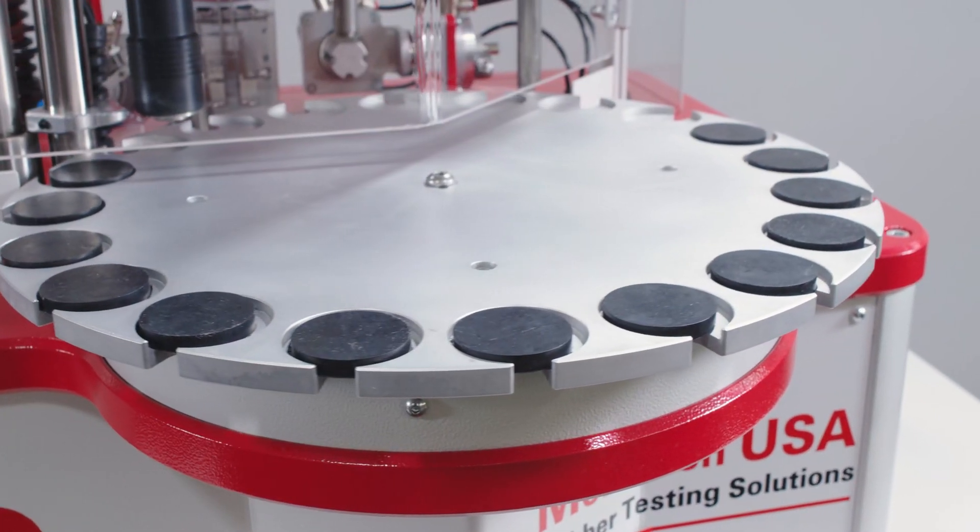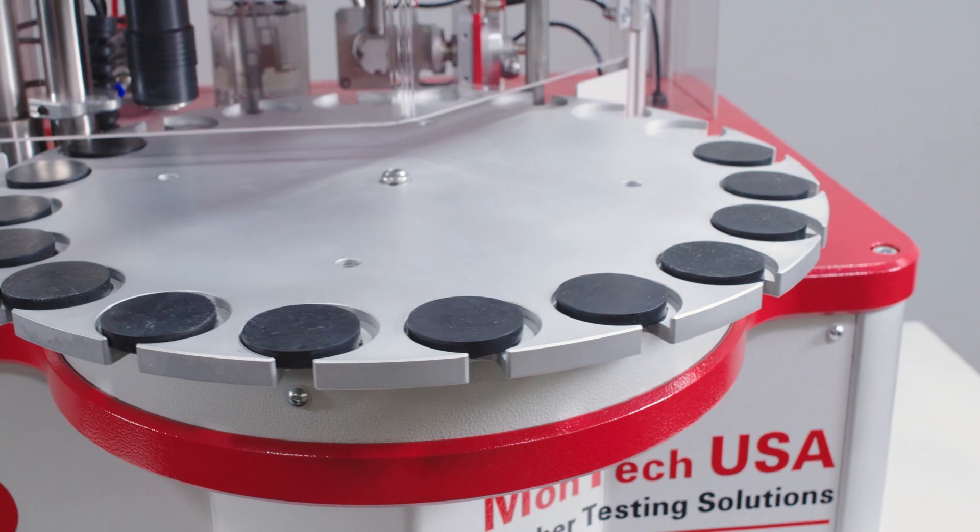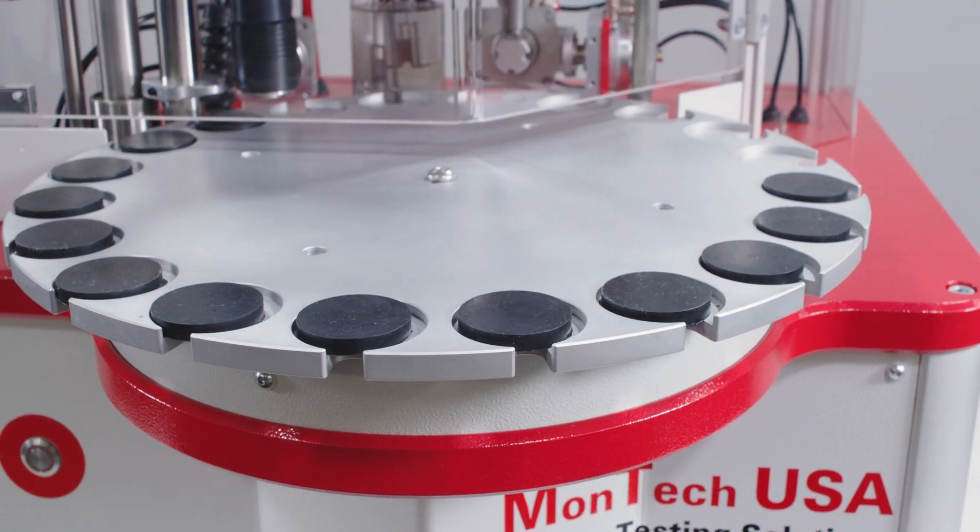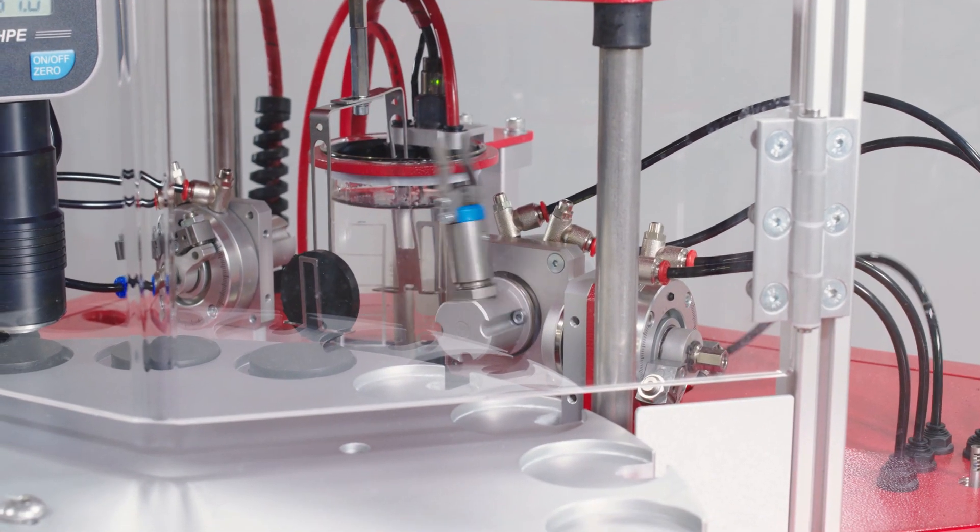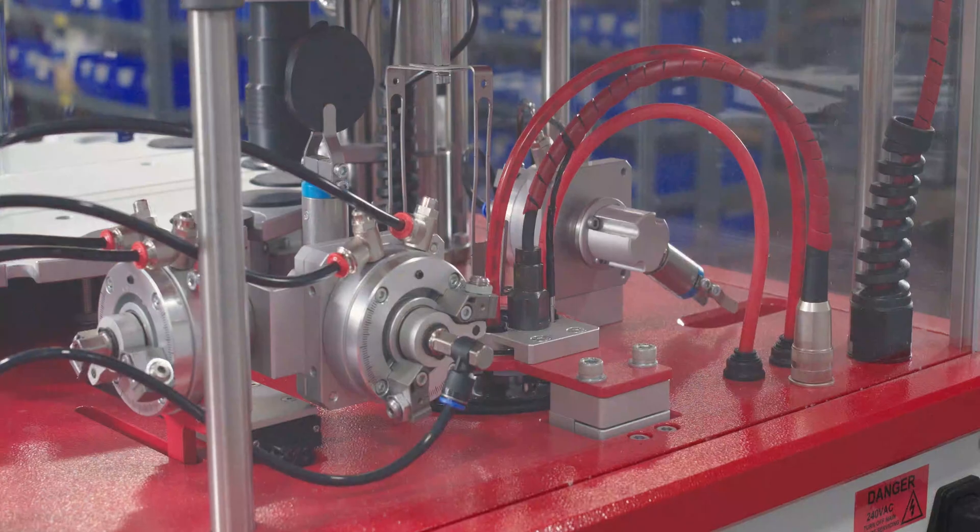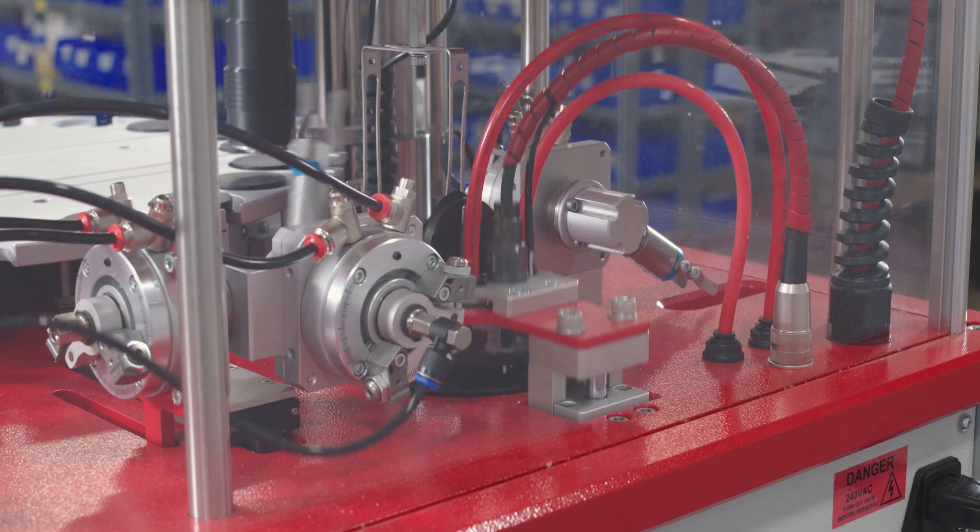The H&D 3000's rotary tray automatically takes the samples through the sequence of hardness and density tests, first testing hardness, then density. This rotary design allows for samples to be continuously loaded, meaning there is never a need for breaks between testing.